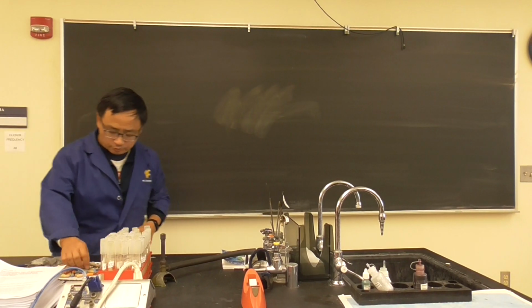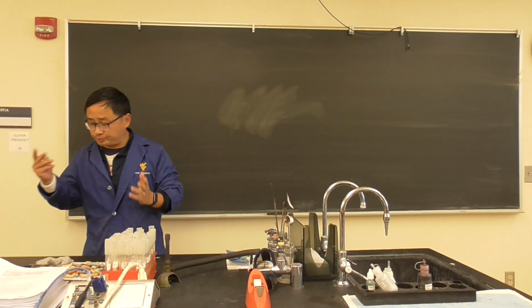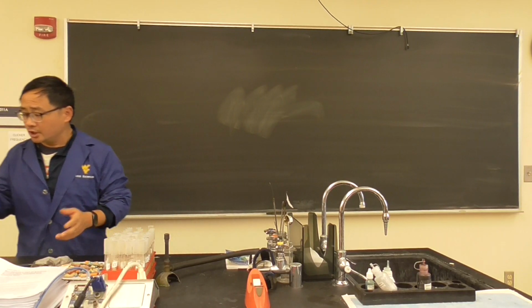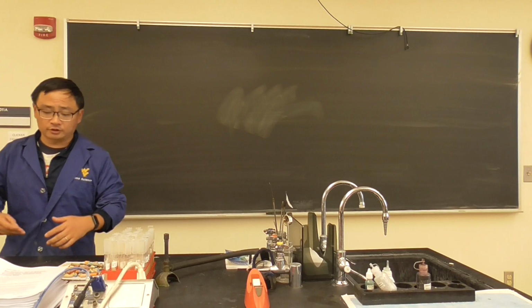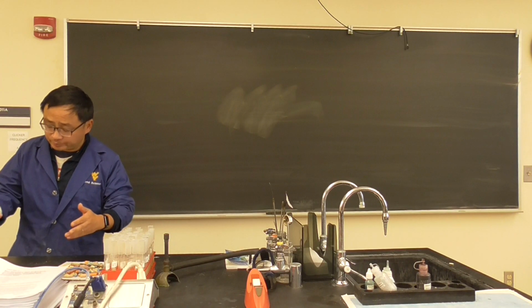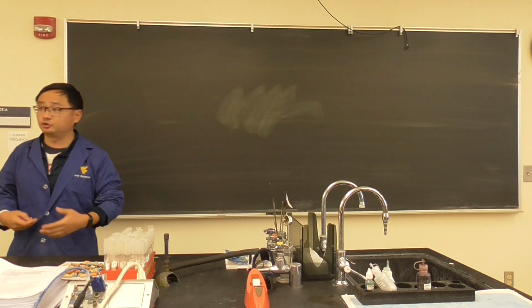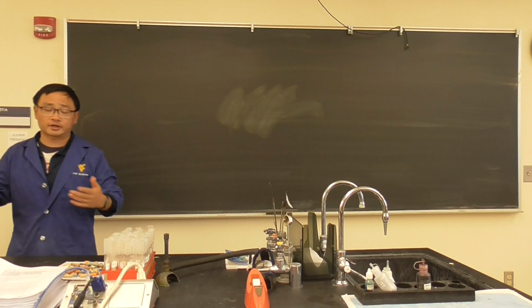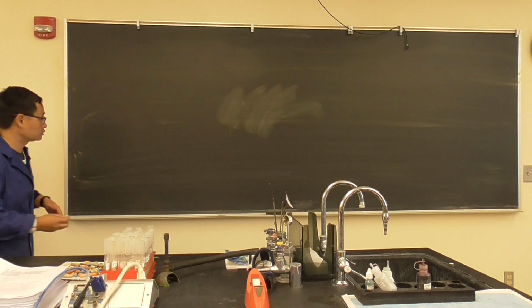We are going to move on to biochemistry tests today, and I will split them into different sections. We will do 2 to 4 each time, and we're also going to interrupt it with some clinical microbiology trials, like the urea test, for example, like throat culture, so that we should have fun with this section, okay?